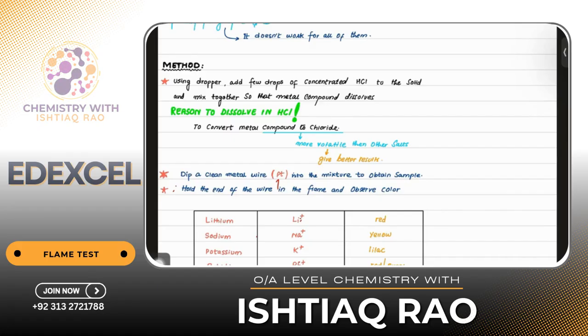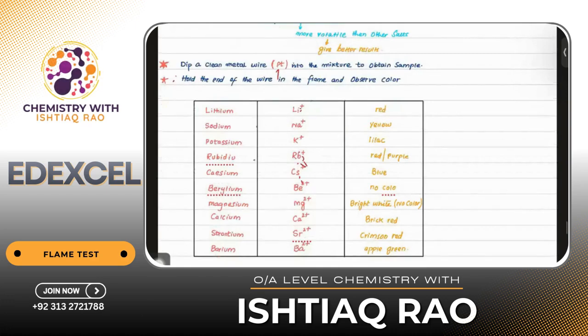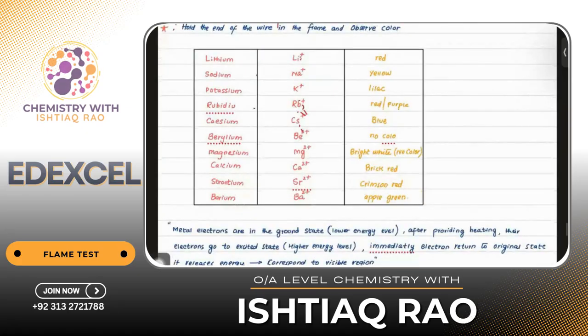Hold the end of the wire in the flame and observe the color. Of course, it would give you different particular colors. This is the list of different metals and their colors. Lithium gives red color. If you have a sodium sample, it would give yellow color, then lilac, and the same goes for the others. You must know these colors.